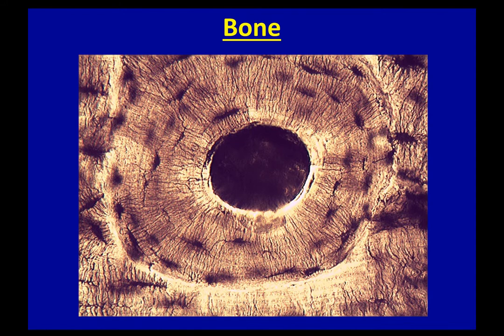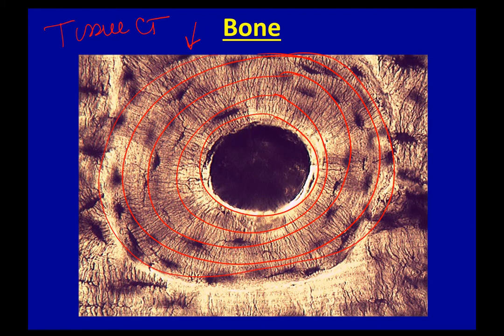Bone. What kind of tissue is it? It's connective tissue. Identify the slide. Bone. Just like with adipose, the visualization of bone on a slide is very distinctive. You cannot mistake it for anything else because it looks like rings that go around like this. Do not say tree. I know you want to, but don't. There's a really good reason why I say that, because people will put that on the test and I don't want you to do that.